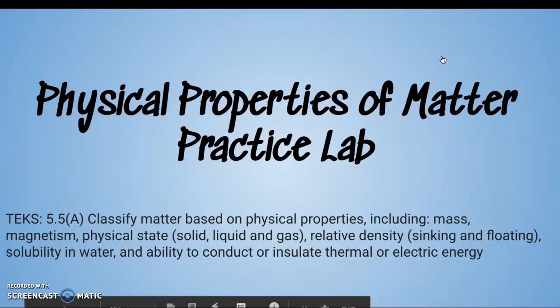Today you are going to be doing a practice lab over physical properties of matter. So let me explain what you're going to be doing. You are going to be using your observation skills today to analyze and describe matter. The state of Texas says all students must be able to classify matter. That just means you need to be able to sort it or categorize it based on physical properties. I guess physical properties are just different ways to describe matter.